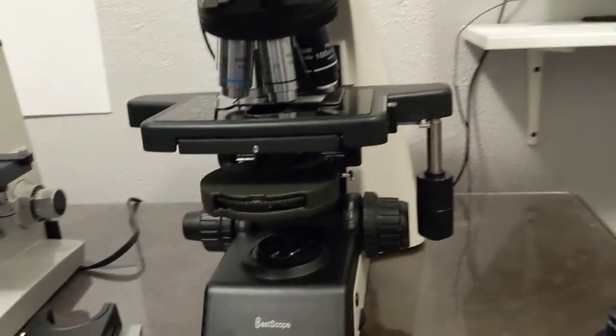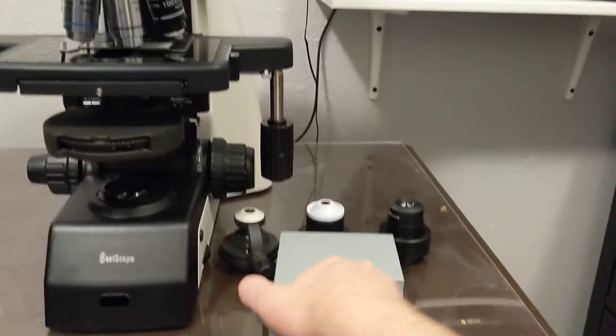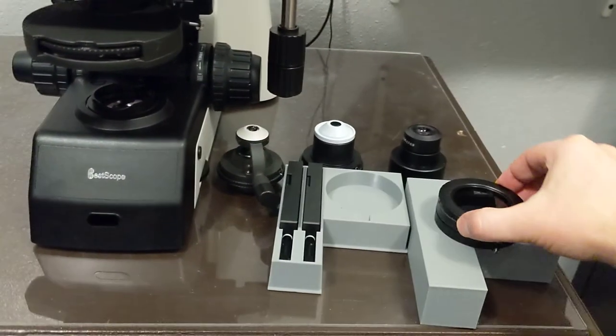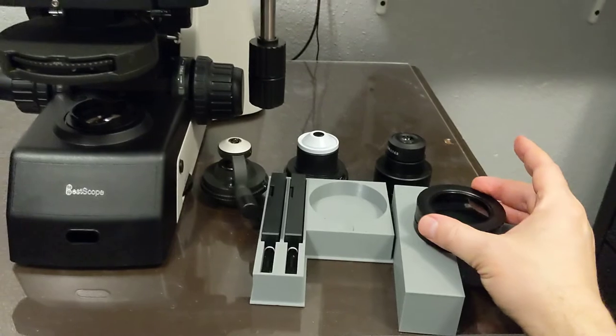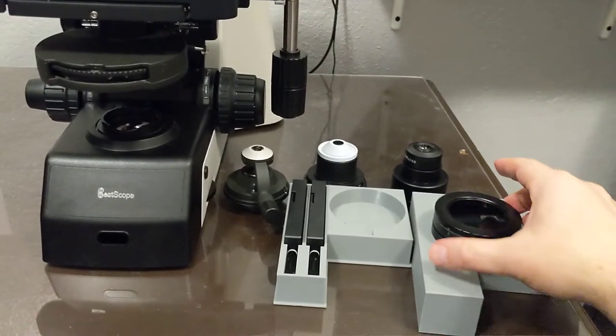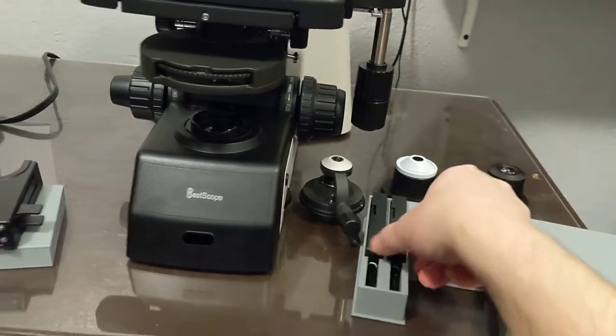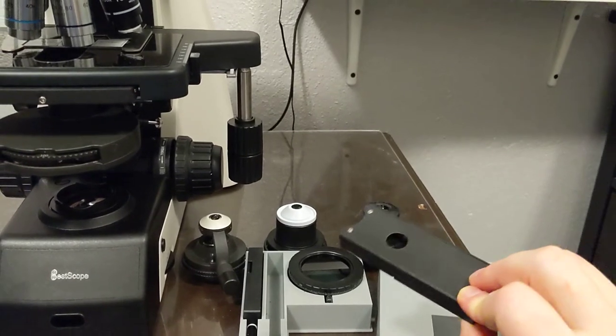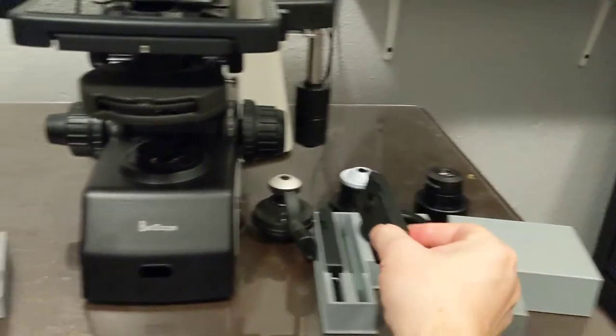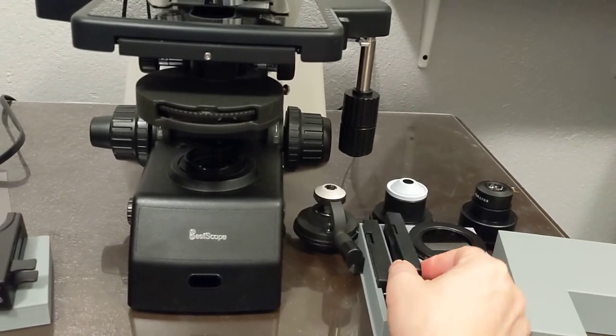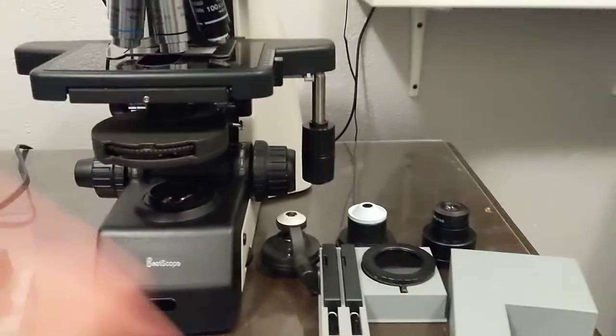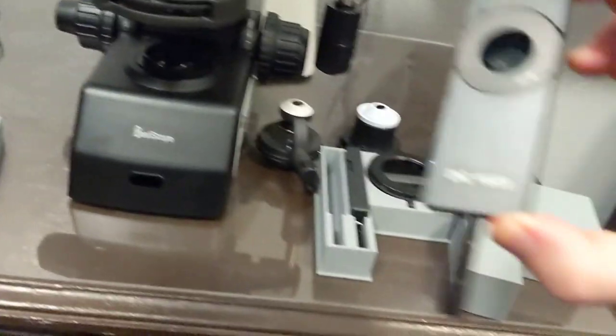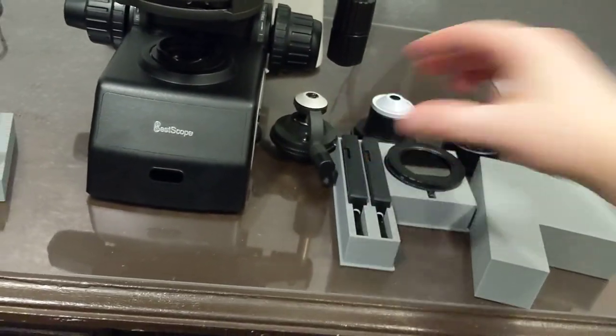This is a box that I printed. I keep my DIC stuff here. Here's the polarizer. You can see it looks just like the simple polarizer, but it's got a rotation. You can swing it out and rotate it. This is what the sliders look like. This has the analyzer and the prism in it. This is the 40-100, and then there's another one for the 20, and I guess 10 and 20, and then that one's 40 through 100.